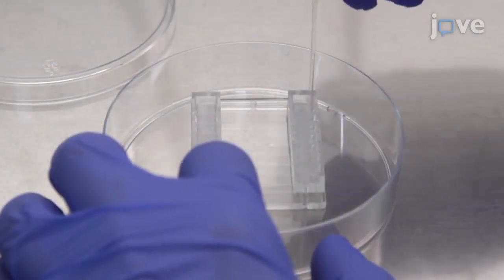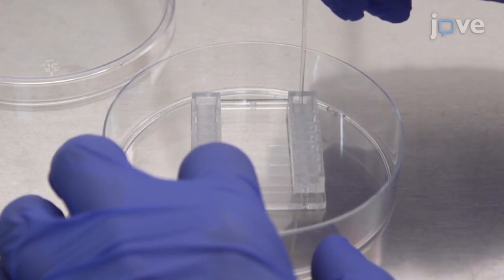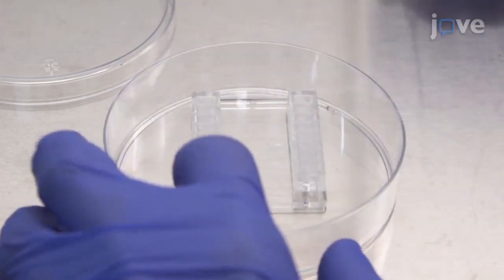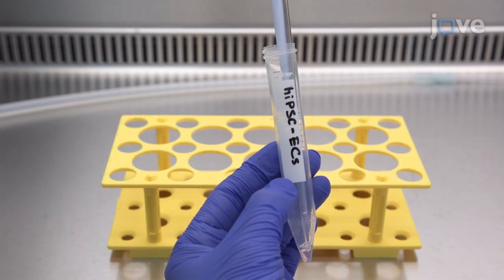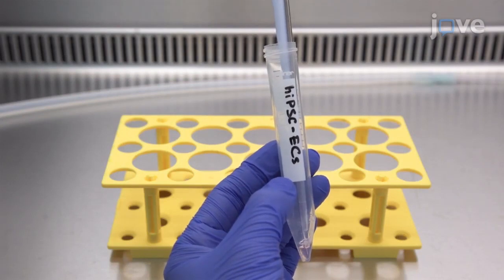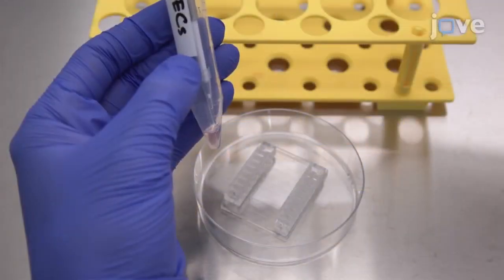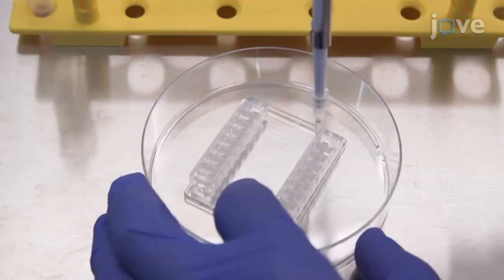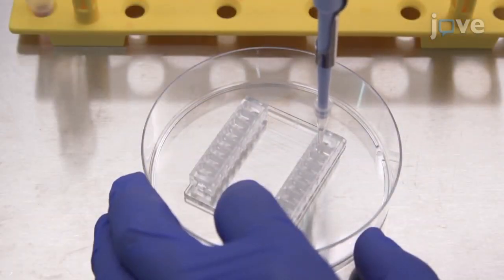Next, aspirate the fibronectin solution from all of the channels of the microfluidic chip and thoroughly mix the cells to obtain a homogeneous cell suspension before using a 10 µL pipette tip to inject 6 µL of cells into each channel.